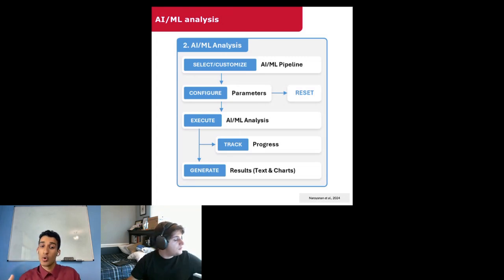Finally, what we noticed when developing the IntelliGenes graphical user interface is that it's very simple with the CLI tool to track progress and how execution is going, because you can just see the log statements in the terminal. With the GUI, we didn't want to compromise on the same convenience, and so we implemented this execution console, if you will, where the user can track progress and debug any potential errors that they might encounter in the same way that they would with the CLI tool.